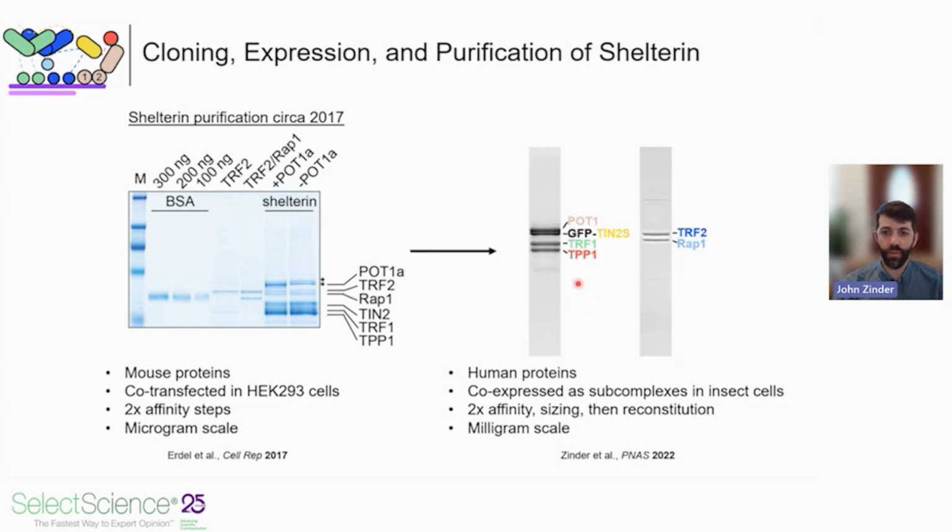And I actually found the most successful strategy was to split them up into subcomplexes that I could then mix and reconstitute into the whole complex and purify by a sizing step. And so we were able to get milligram scale from these protocols, and that was enough for us to do much more in-depth biochemical and structural studies.